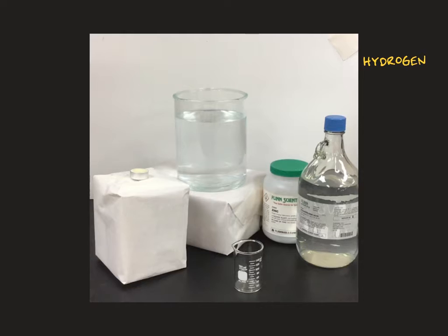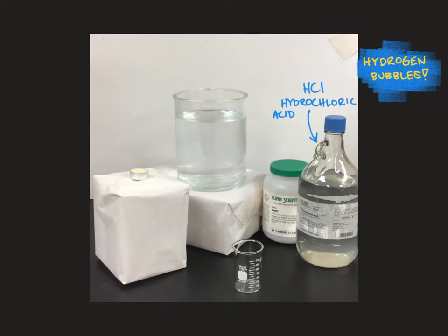You'll notice that we have a large jar filled with hydrochloric acid. This jar actually contains concentrated hydrochloric acid, which is a very dangerous chemical substance. We're going to dilute that hydrochloric acid to make it a little bit less dangerous to deal with. The other chemical we're going to be using today is a familiar metal, something you actually need in your diet, a metal called zinc. So we're going to get started by combining together the hydrochloric acid and the zinc.